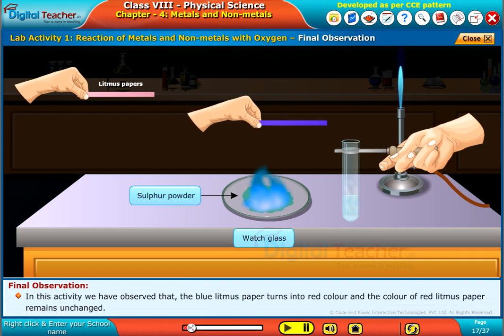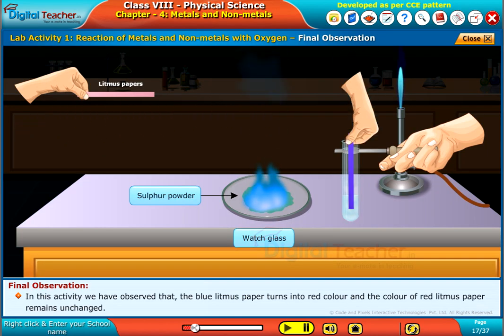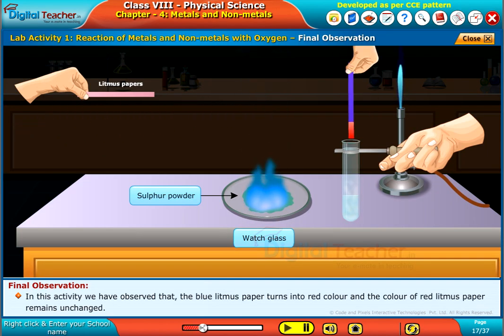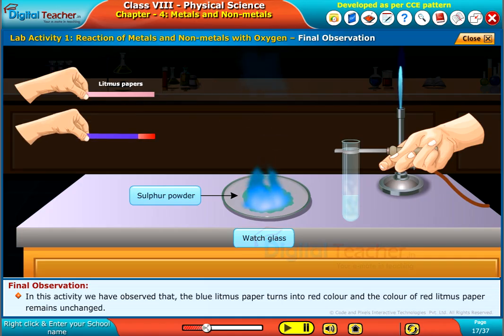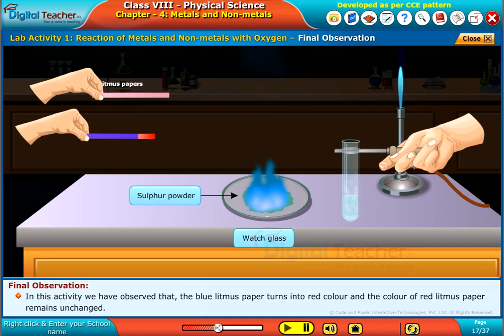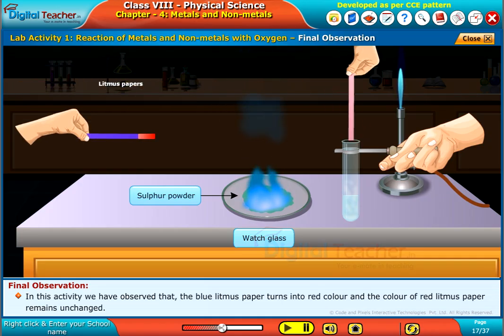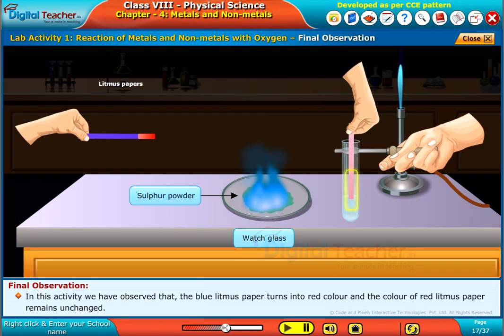In this activity, we have observed that the blue litmus paper turns red and the colour of the red litmus paper remains unchanged.